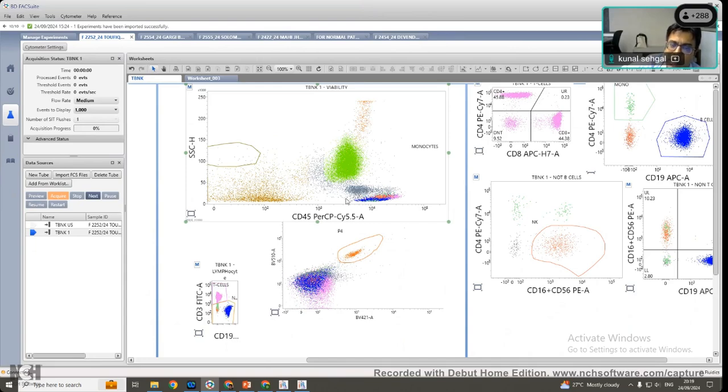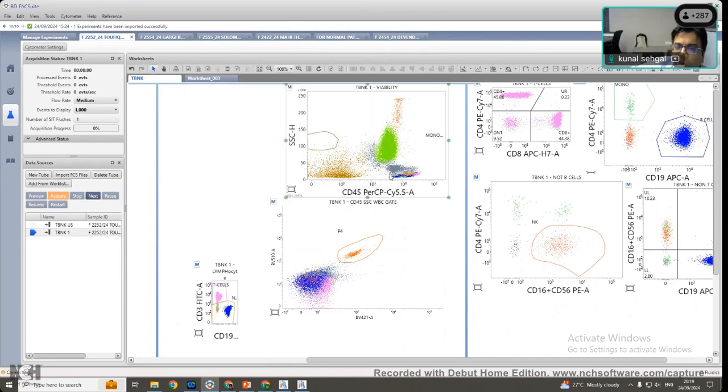So we identified eosinophils, you identify green color neutrophils, which are high scatter monocytes you saw. Basophils end up lying here. For basophils, you will need one more marker, CD123, to ideally identify the basophils. Retrospectively, you can. But in this assay, we have not put those antibodies to identify my basophils.